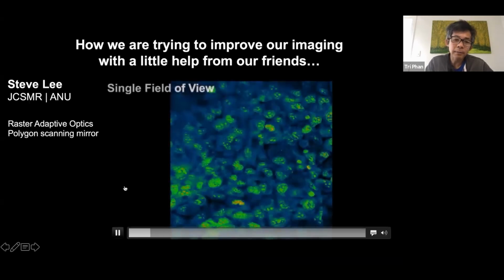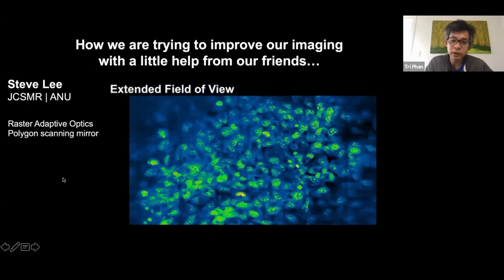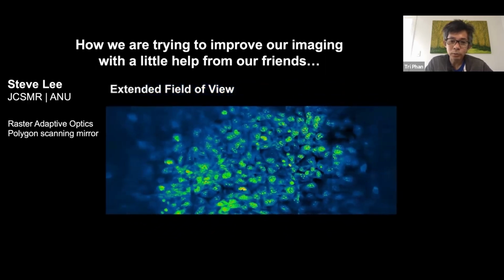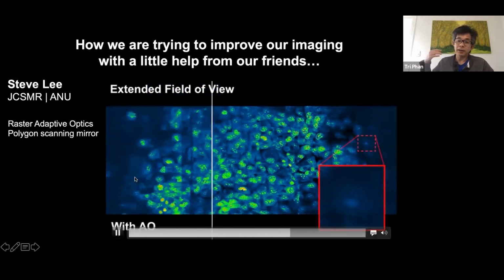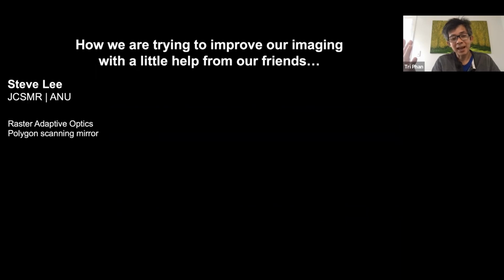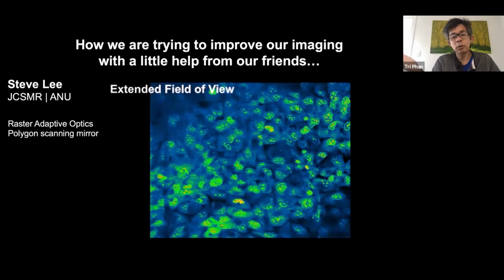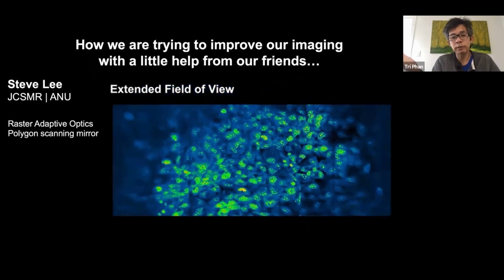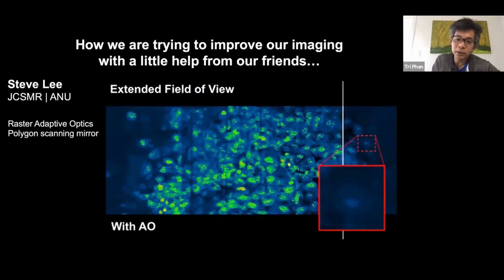Steve has developed this brilliant technology, which hopefully he will implement for us and allow us to do imaging at much faster speed, which is really critical, but also allow us to image bigger volumes. And using the adaptive optics technology, the imaging quality should significantly improve. That will overcome a lot of the problems, I hope, that we're having trying to penetrate that deep cortical bone tissue that I mentioned at the beginning.